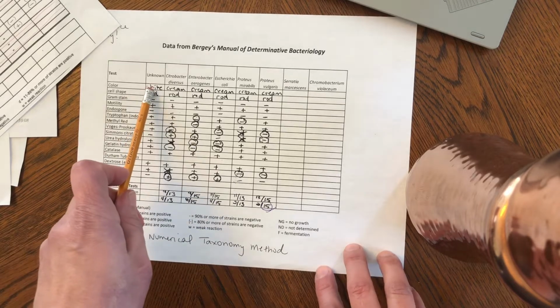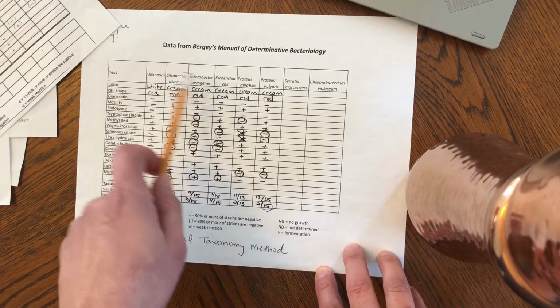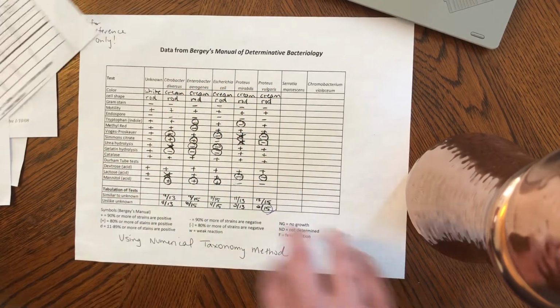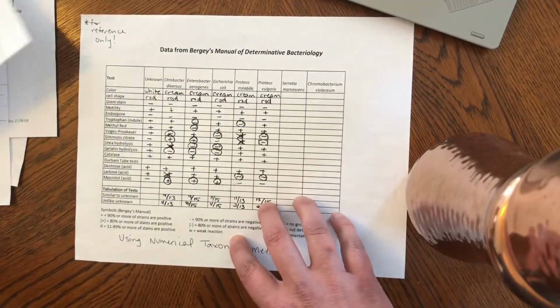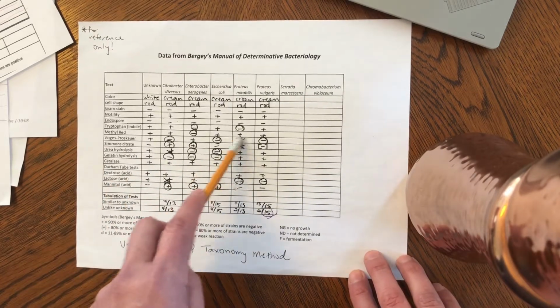But notice that here I wrote all of my test results. In this case, I've got test results for 1, 2, 3, 4, 5 bacteria that I'm comparing my unknown to, because this is for reference. This would be the one that you're actually doing your work on. This is just to show you how to do it. Anyway, so I write all my test results there. I've got some things that are crossed out.